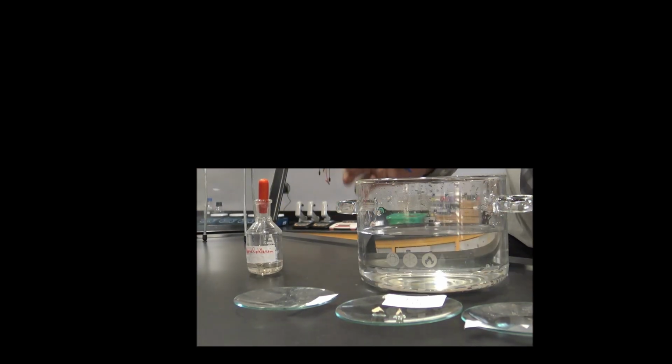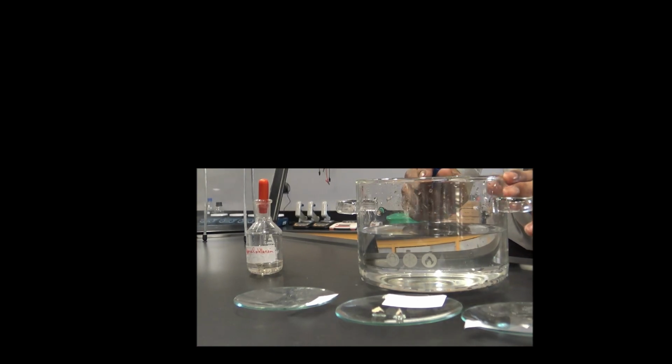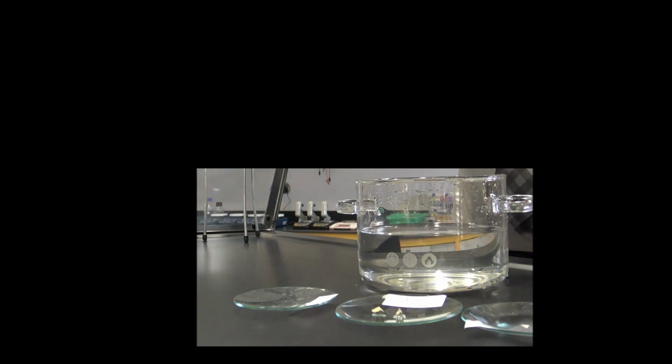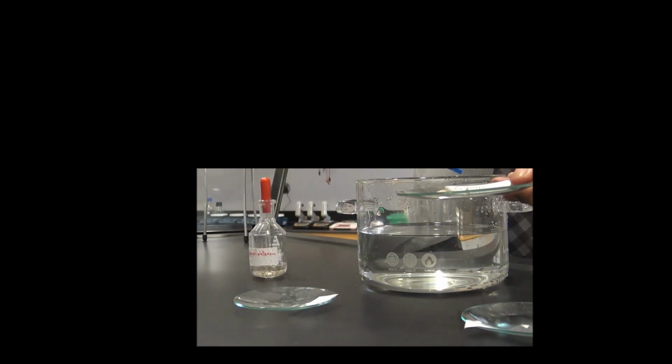So we have done lithium, and you saw the reaction. I have changed everything. In fact, I've changed the water because I don't want to do the second reaction with the same water, as that would be more explosive. So again, I add a few drops of indicator, and as you know, I'm expecting an alkali, so it will be purple. I'm using the next metal, which you can see is sodium.